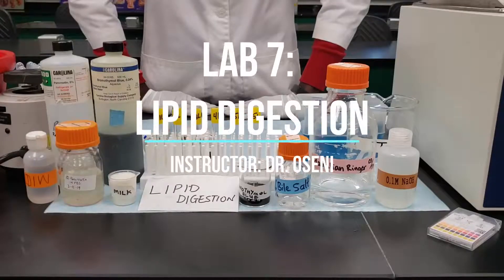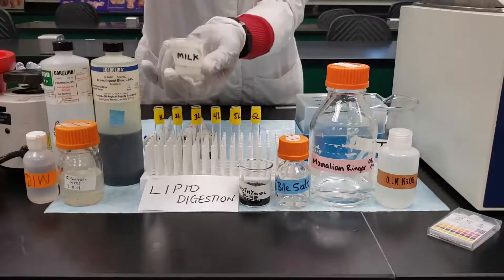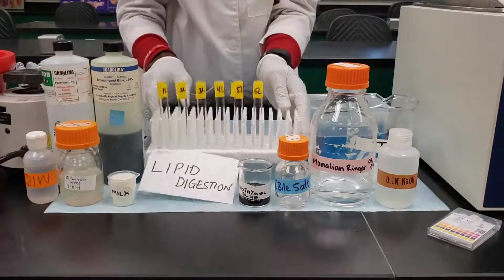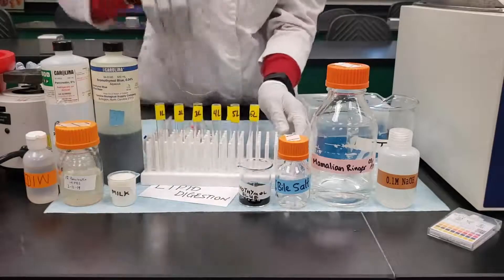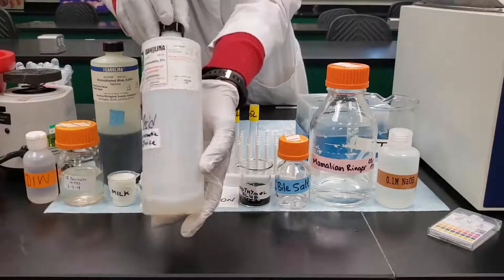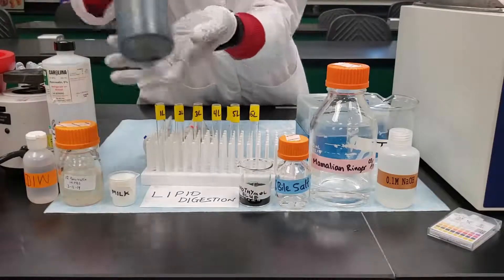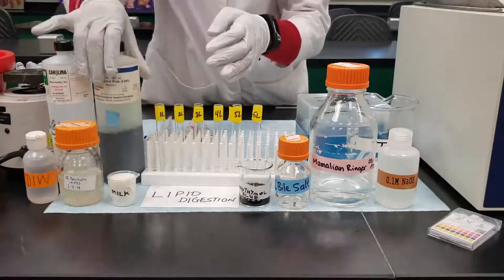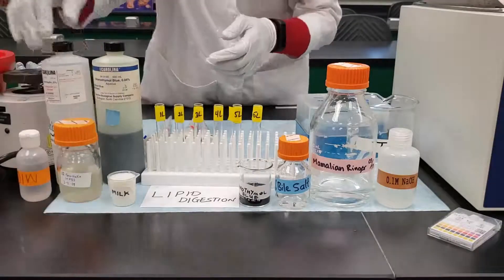The last experiment is lipid digestion and the following materials are needed. You need to have your substrate — in this case we are using milk. After that you need to have six test tubes labeled 1L to 6L, your enzyme source which is pancreatic juice, a standard called bromothymol blue to test for pH, and deionized water.